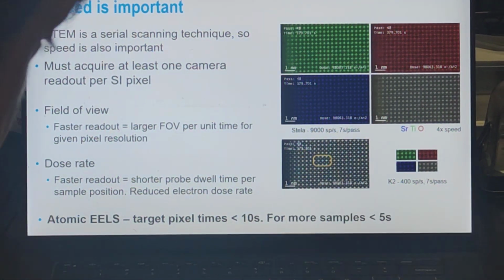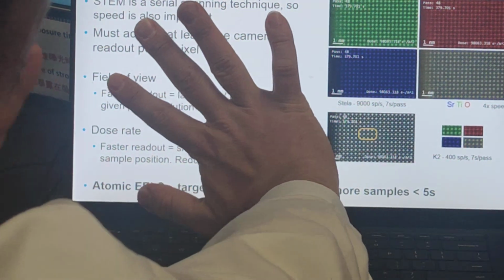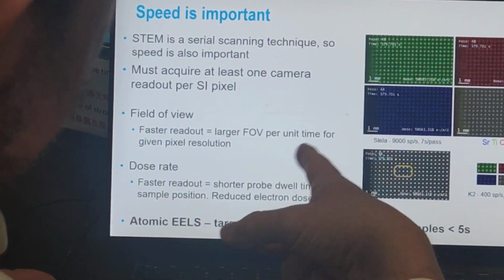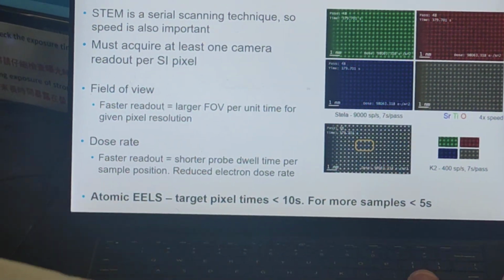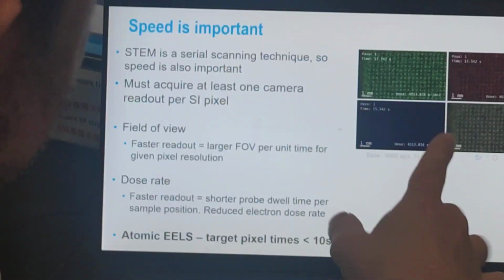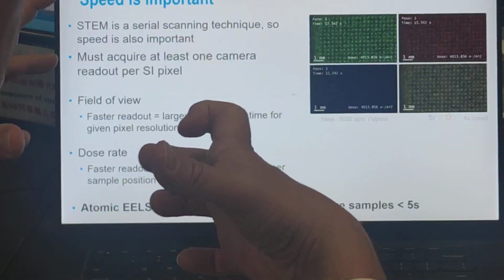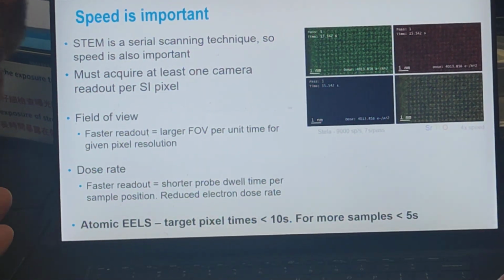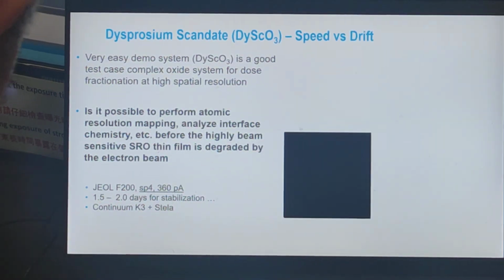And then the other thing that's really handy about having all of those separate is, imagine we do 200 of these, and it's accumulating, and at pass 199, you're like, oh, that's a bad one. It's in the data. Whereas if you have them all separate, you can just say, I know that pass 199 is bad, I throw it away. Or it's something that's beam sensitive, the last 50 are damaged, we'll throw them away. Or it's a time resolved experiment, where you're actually interested in something dynamic, you can do that. So good to know.